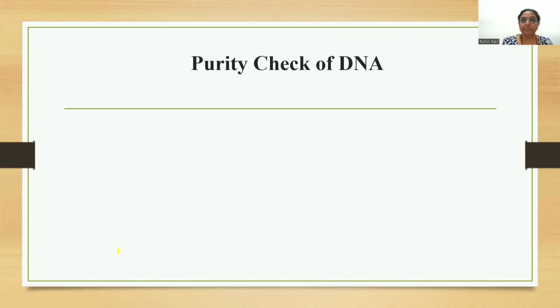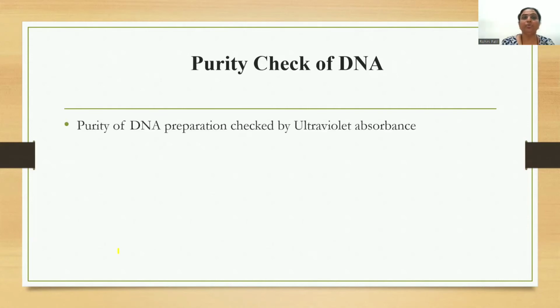For that purpose, again the UV visible spectroscopy is used, and the sample is measured at 260 nanometer and 280 nanometer.